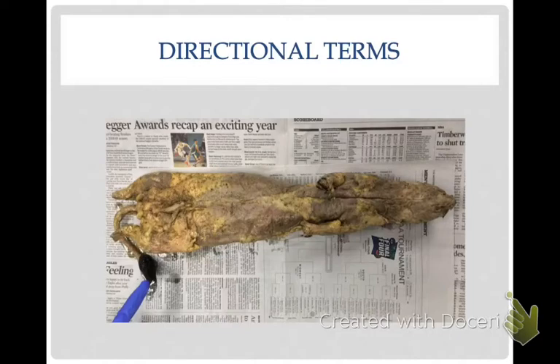And that's hard for me to show you on the mink the way that the mink is laying on the tray here. So the next thing I want to do is talk about some of the external regions of the mink. And I'm going to label them on the slide for you so that if I say this particular region, you know what I'm talking about.